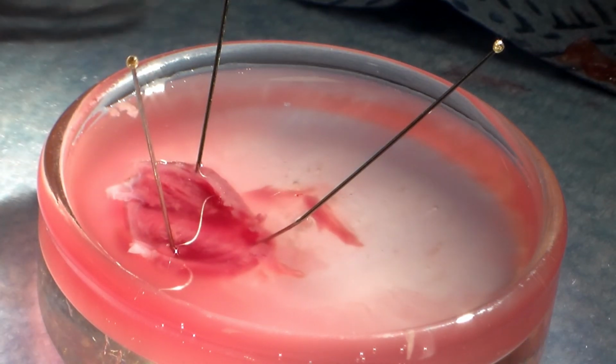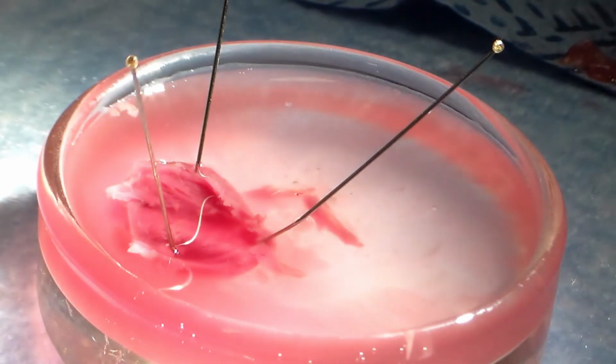Once the papillary muscles have been removed, they are then taken away for clipping.